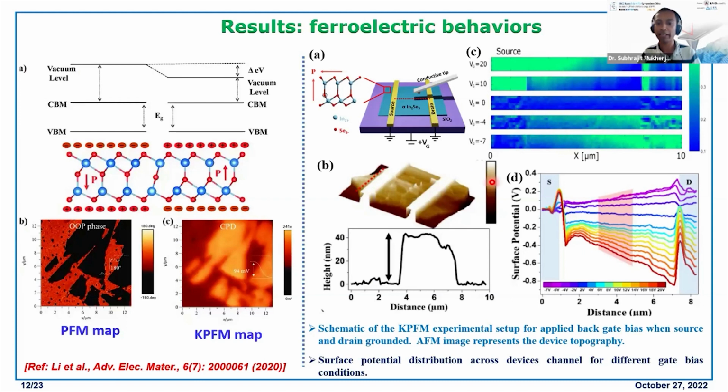So let's directly jump to our results. Before going to our Kelvin probe results, I just want to mention that people generally use piezoelectric force microscopy, or PFM, to detect this phase, whether it's an out-of-plane or in-plane phase, or in which directions the dipoles are aligned.